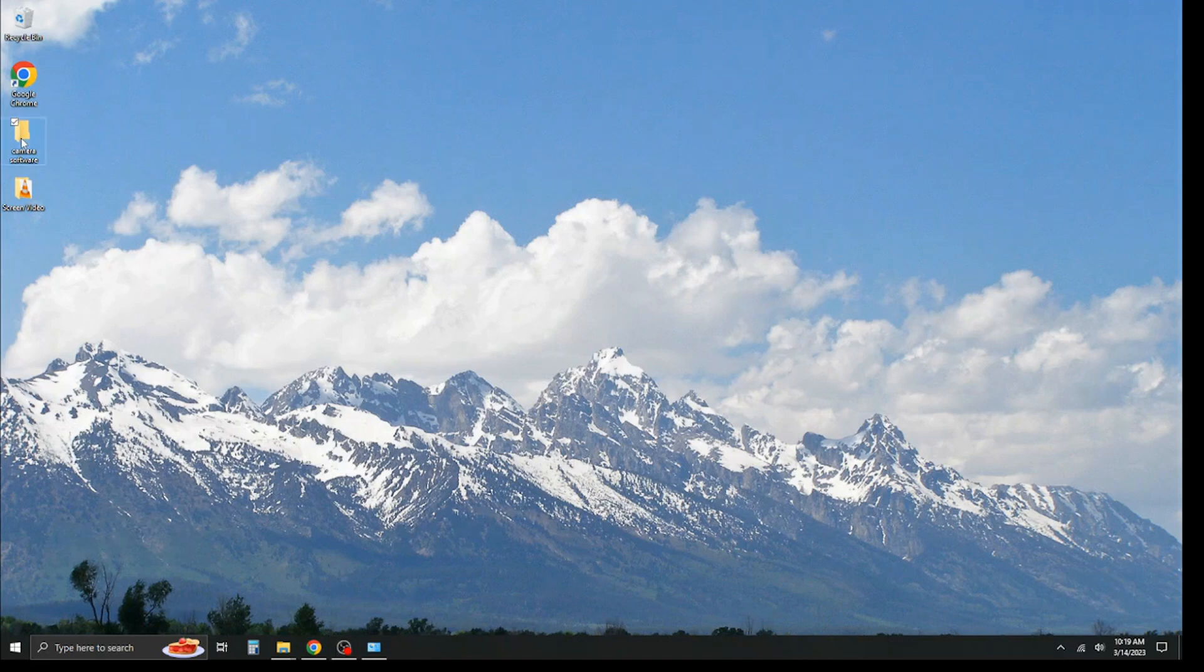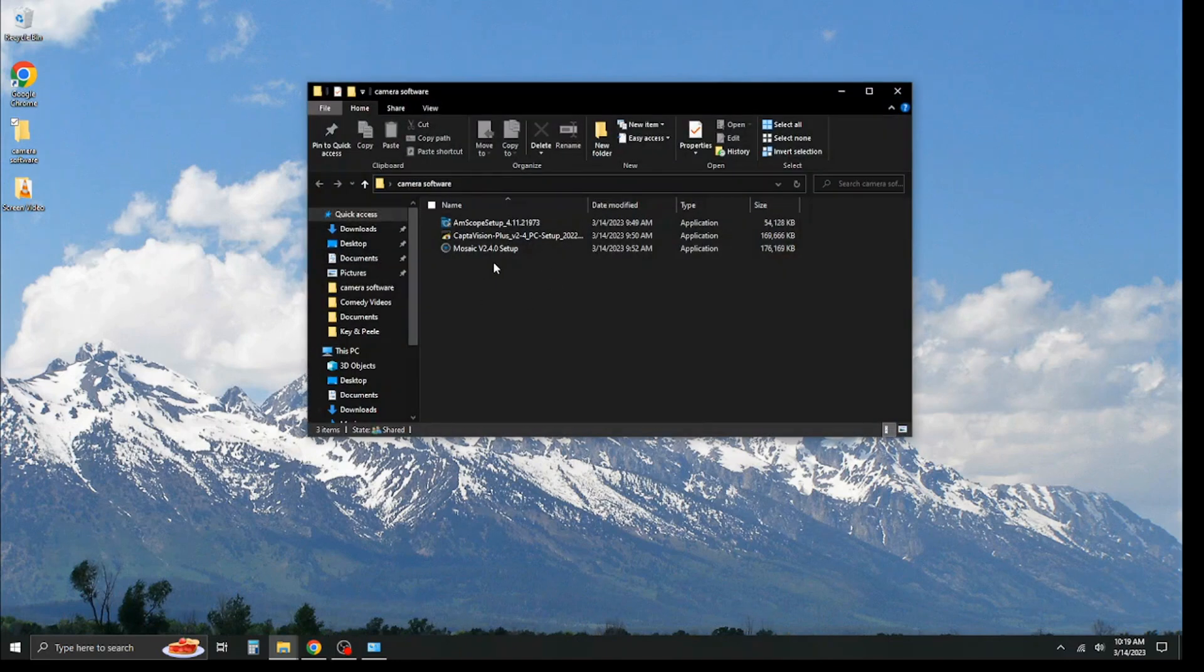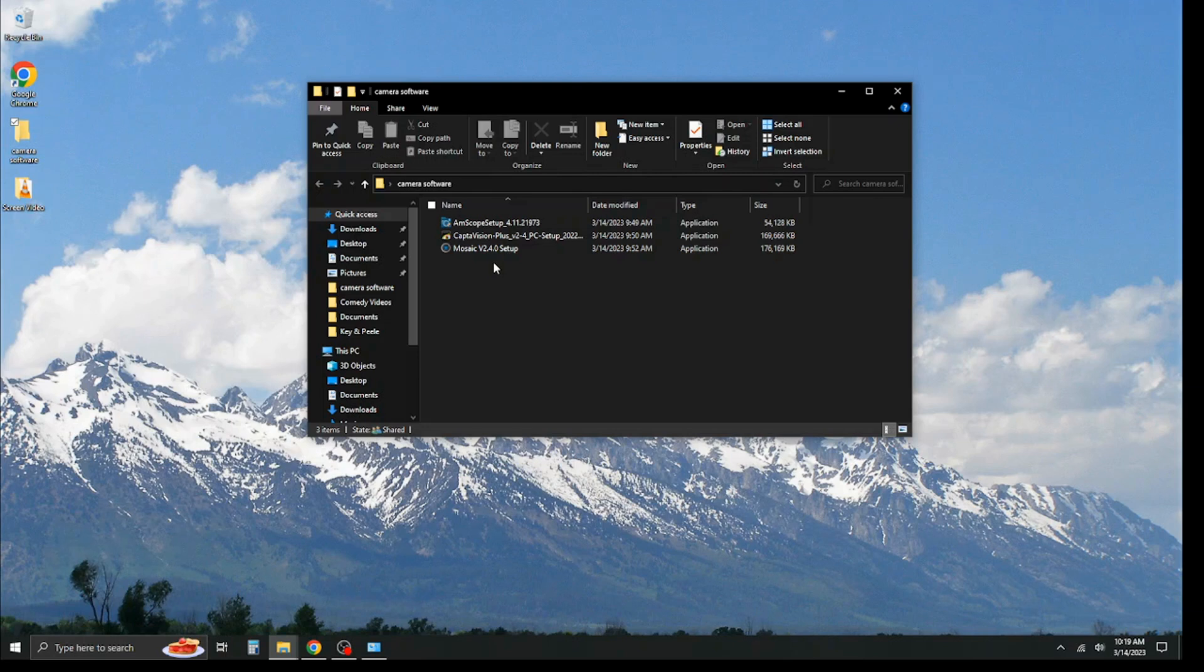In terms of acquiring the software, I have it downloaded right here, but your camera will either come with a flash drive in the box that contains the software, we'll send you a link to get the software, or we can direct you to the webpage where you can download the software yourself.